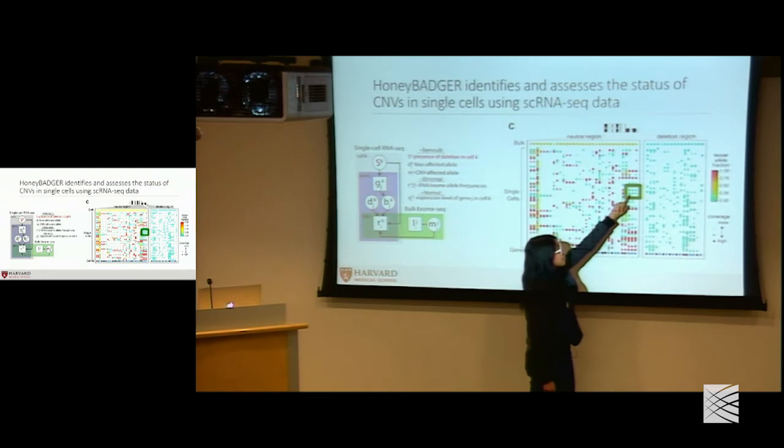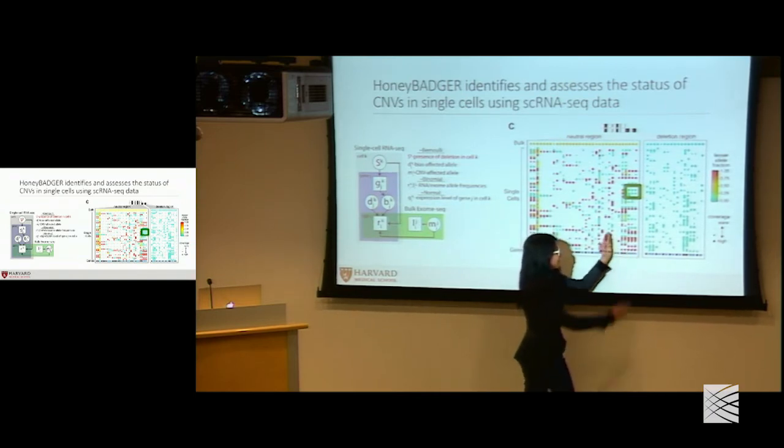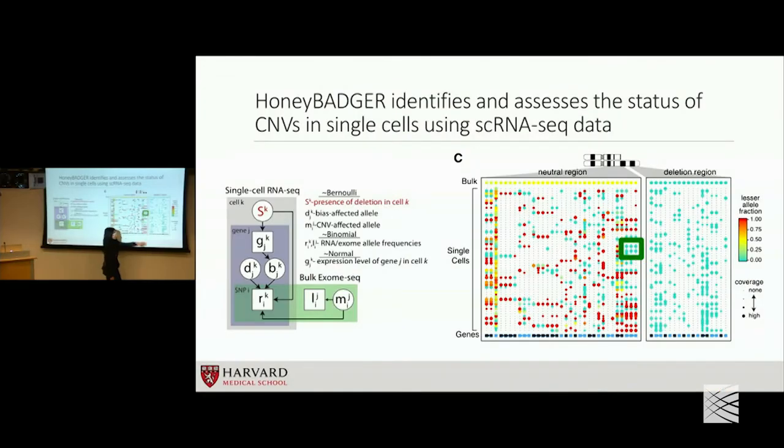However, we could also see something like this, where there are 3 SNPs that show coordinated expression of only one allele, so pure allelic imbalance. However, they're all contained within one gene. So even if we were testing just this region to see if there's a focal deletion, we would get a very low posterior probability, simply because within a particular gene, we know there to be high levels of monoallelic detection. Is that how long have we known that?